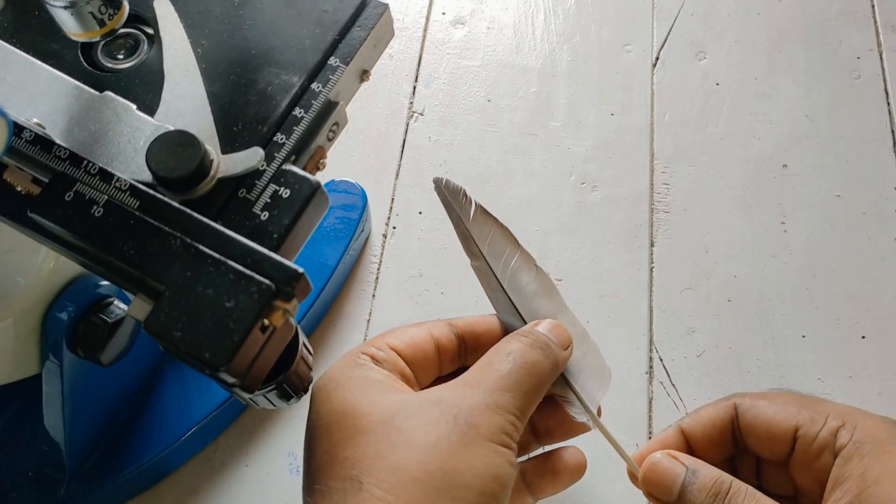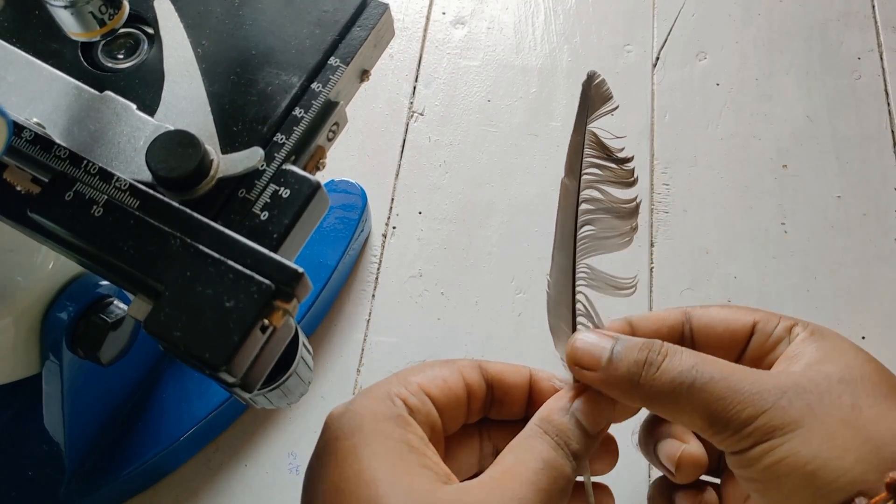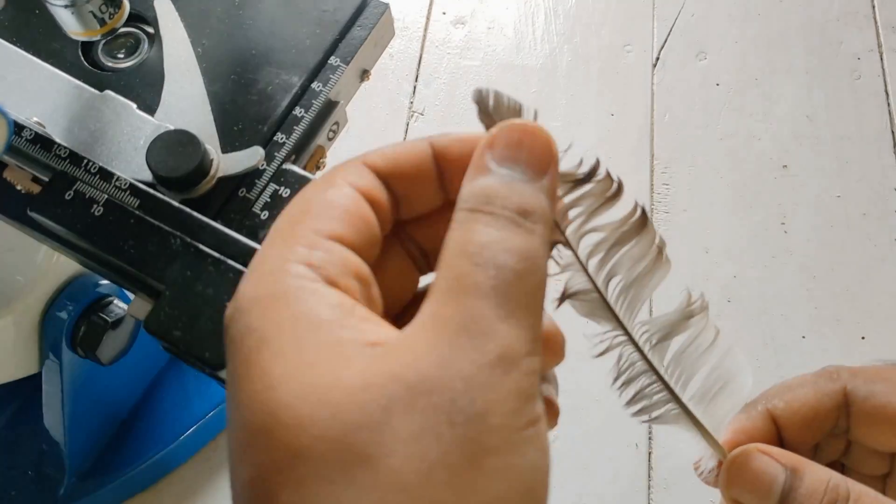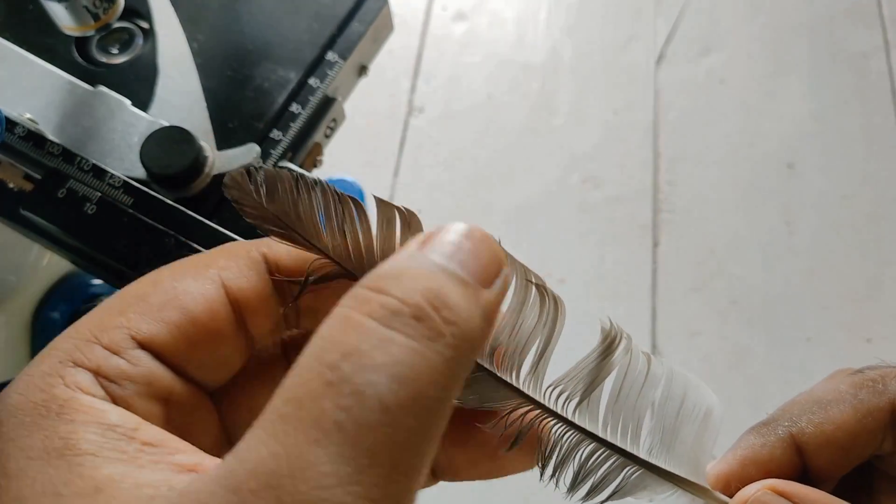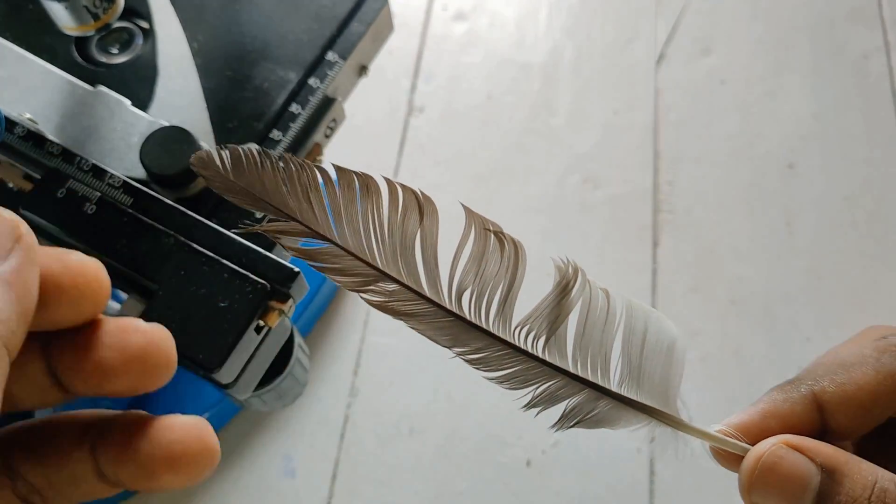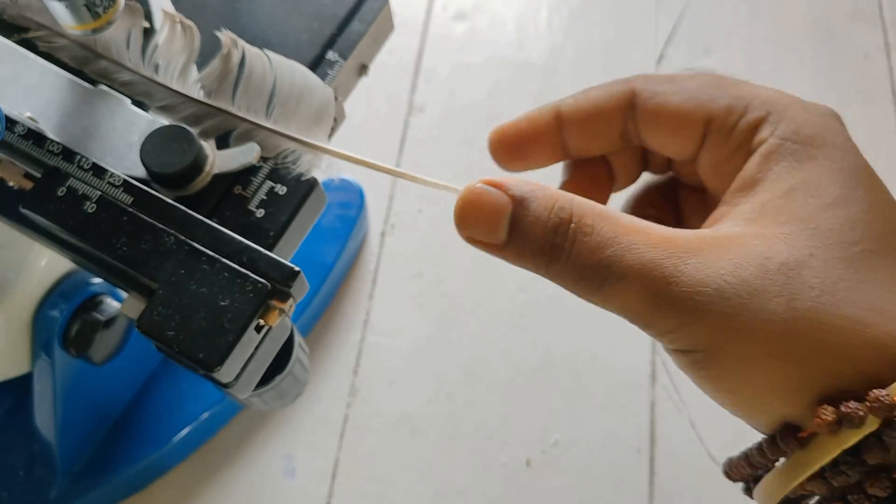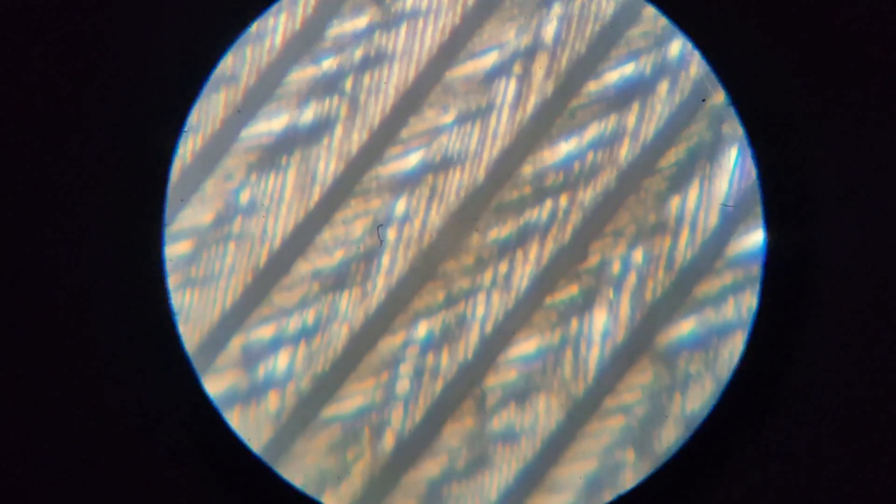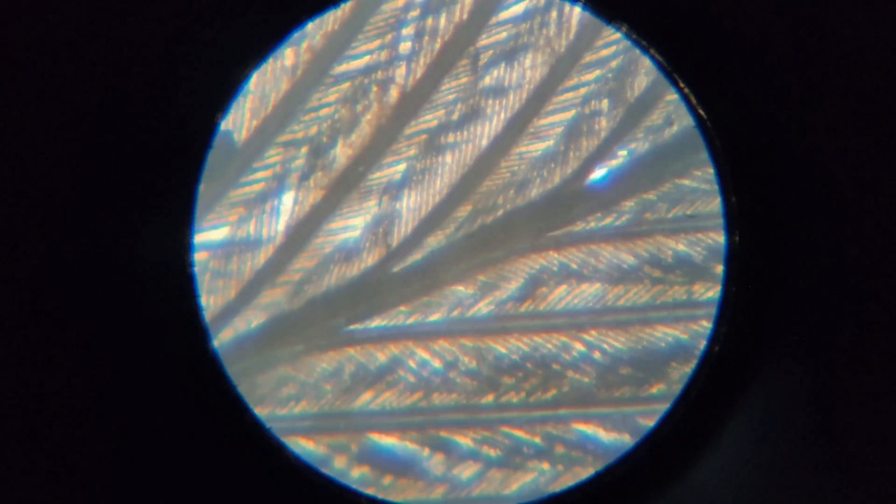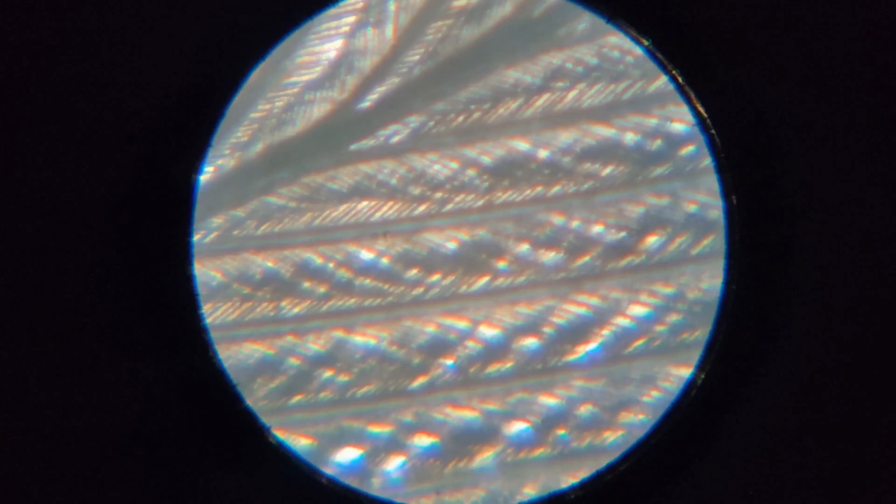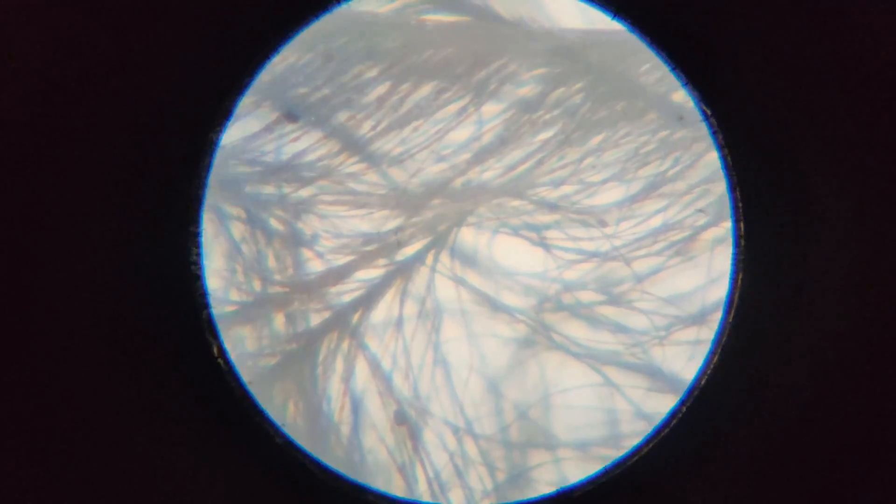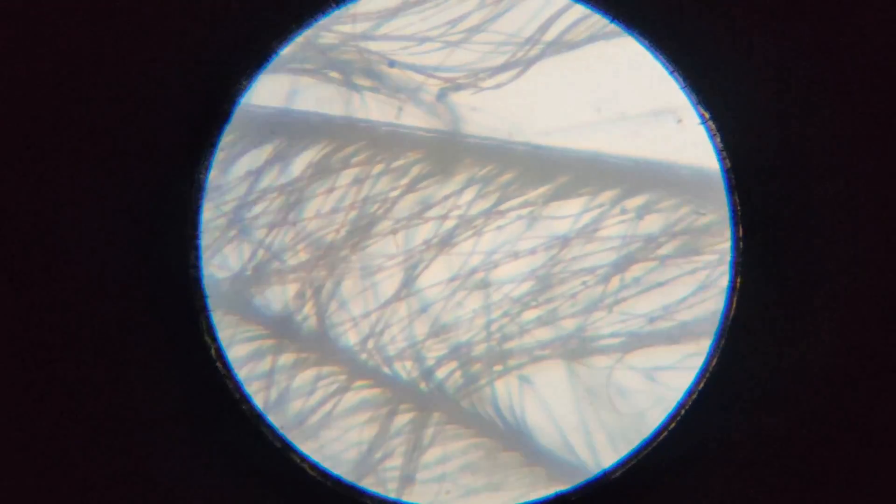Okay, now a real bird's feather - a feather of a pigeon. Let's see how it looks under the microscope. Okay, okay, not so cool, but definitely get the idea now. These soft strings are the bottom part of the feather.